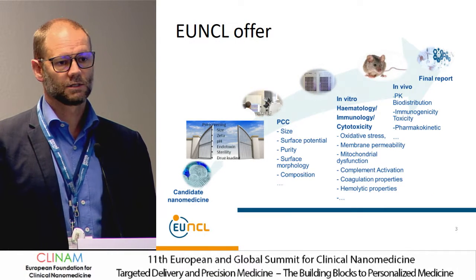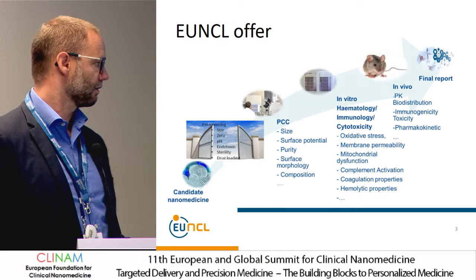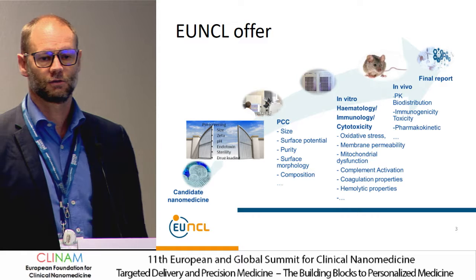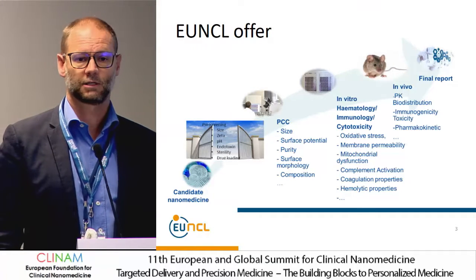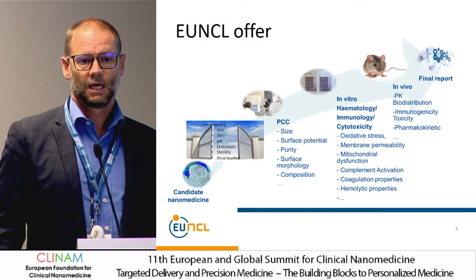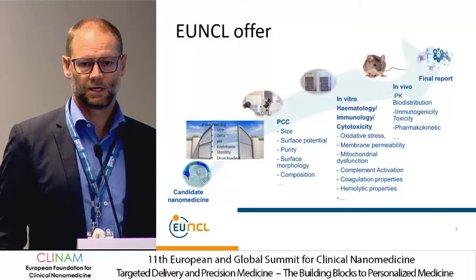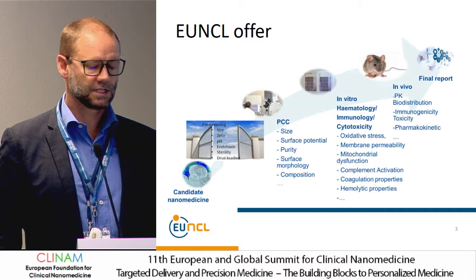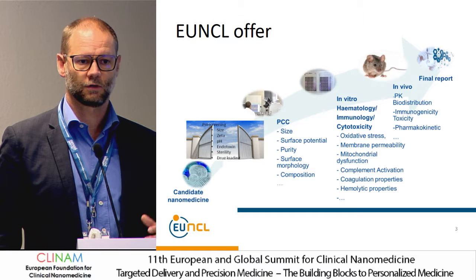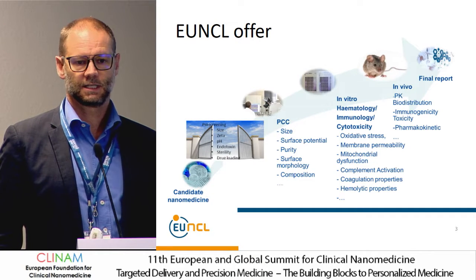There is one big issue usually in this application, and we have identified that as a gate of entry to EUNCL services. It's the contamination. Endotoxin and bacterial contamination is a key issue you have to handle, and we can help you to handle it for going through the process of characterization. This is really the main point of care we have when we receive the candidates and the material.